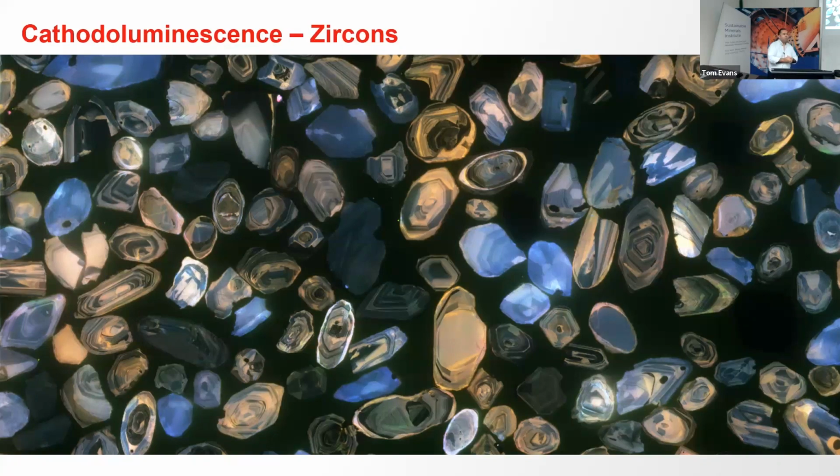We are working to improve that workflow by combining automated mineralogy with laser ablation ICP-MS. That will give you additional information that you might not get from purely EDS. But of course, it's always a good idea to do a correlation with XRF or XRD, because that's what gives confidence in the results. Also, in cases where you have ambiguous answers, EDS is a purely chemical analysis technique, so it's not going to give you information about polymorphs. If you want to resolve those polymorphs, it's a good idea to use XRD or Raman spectroscopy as well. Raman is another very popular technique for cases where you have polymorphs of the same mineral.